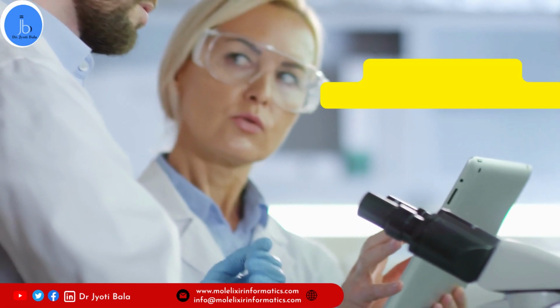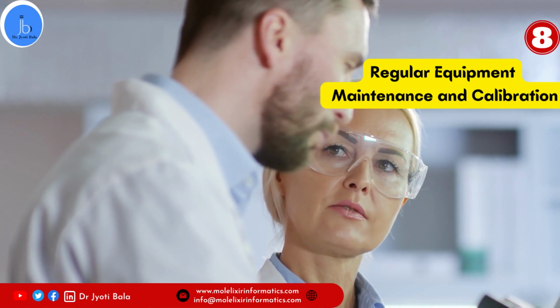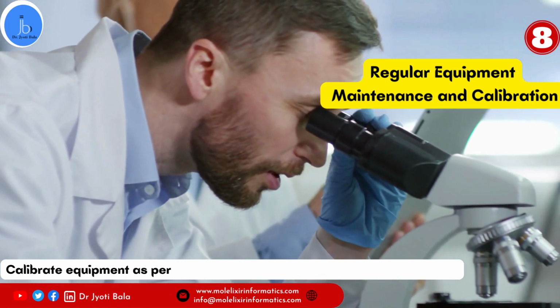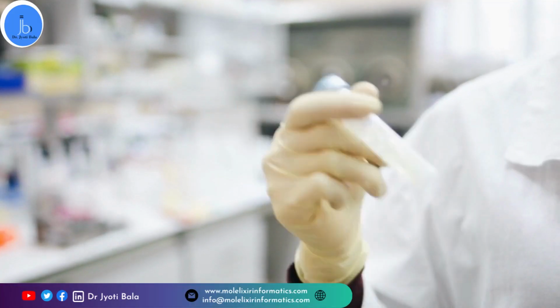Moving ahead, number 8 is regular equipment maintenance and calibration. To ensure reliable results, regularly inspect and maintain lab equipment. This includes calibration as per the recommended schedule to maintain accuracy. Well-maintained equipment contributes to the overall quality of your work.